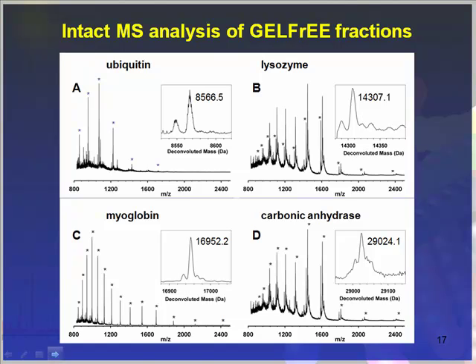We can do MS analysis of intact proteins. It's the same concept here where samples are collected in SDS, so of course we need to remove the SDS. Again, the chloroform-methanol-water precipitation.